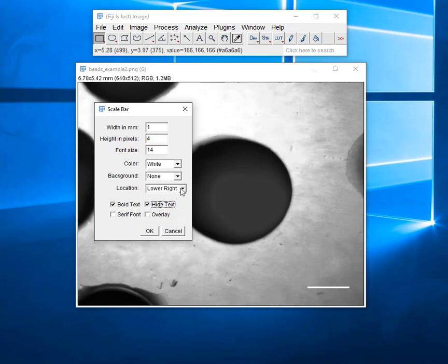Also, this is very thin, so I suggest making this much thicker. You know, 16, whatever size you want in pixels. The font size doesn't really matter.